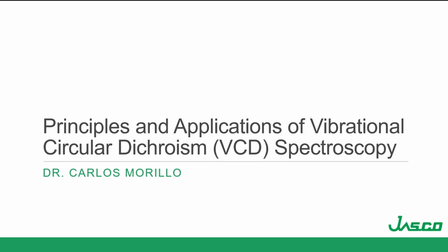Okay, thank you, Leah. Thank you everyone for joining us today. So today I'm going to be talking about the principles and application of vibrational circular dichroism spectroscopy.